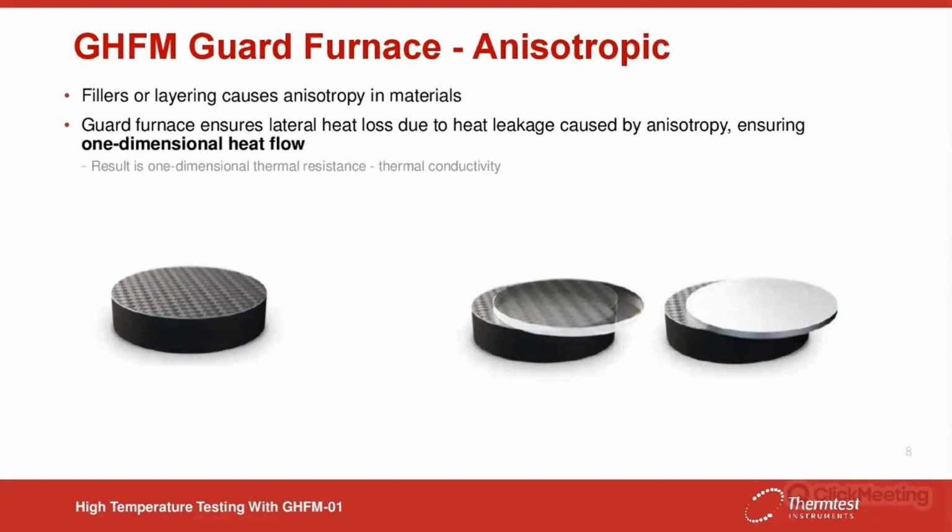When considering transient methods for layered structures, the requirement of anisotropic testing or even one-dimensional is that the alignment of particles or the anisotropy through the thickness is repeating and well organized. We do talk about this in other webinars, how at different time scales, if your thermal conductivity is different through the thickness, you are not following the theory of those transient methods, and you'll result in unknown thermal conductivity errors.